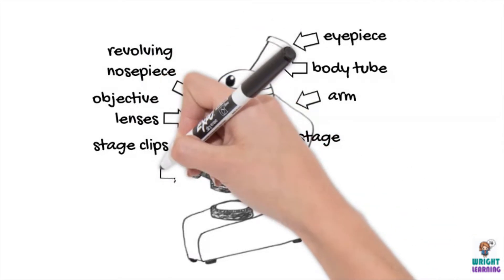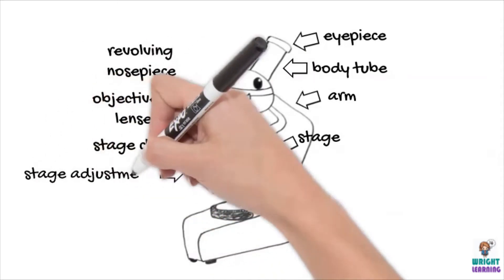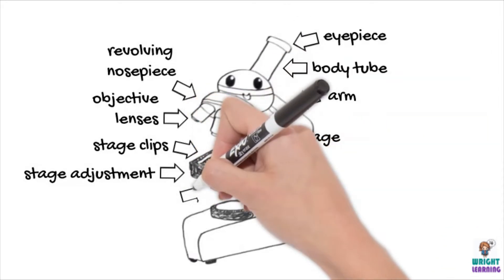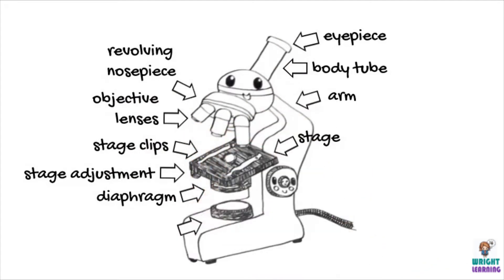Some light microscopes have stage adjustment dials to easily move the stage from side to side. We can see our sample because light passes through it. We can use the diaphragm of the microscope to adjust the amount of light we're using to view our sample, which is directly above our light source.